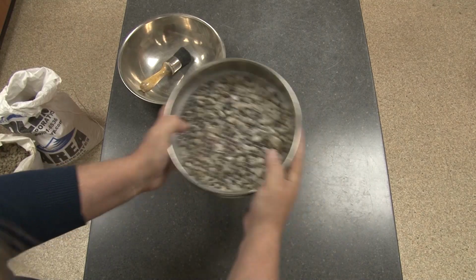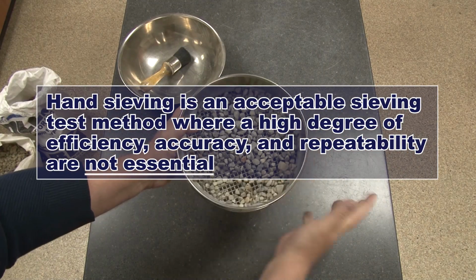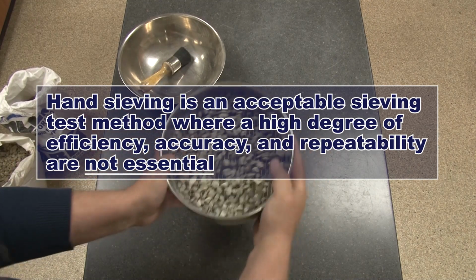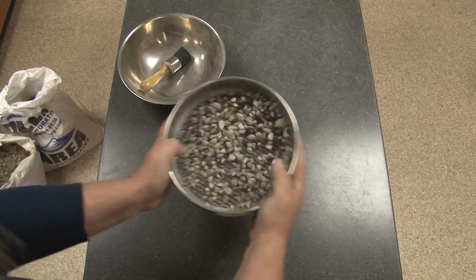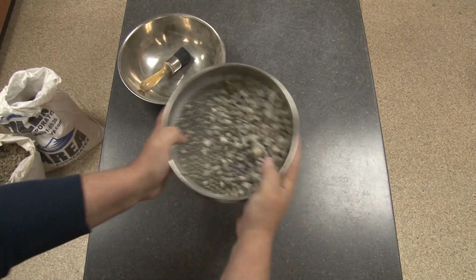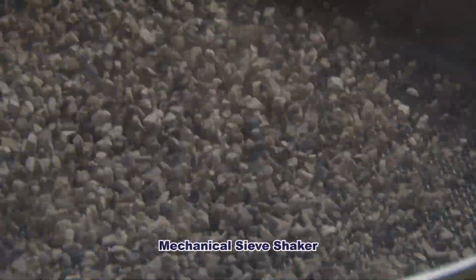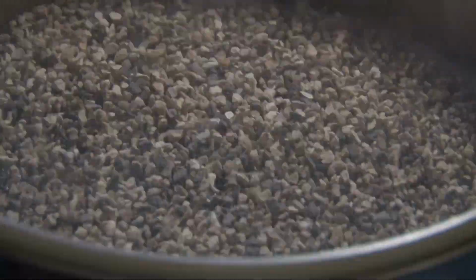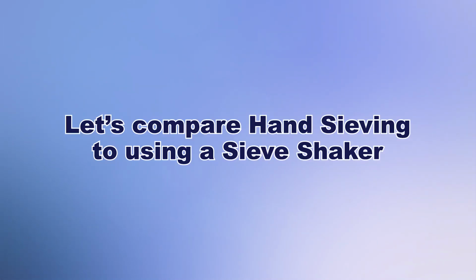Hand sieving is the most basic way to perform sieve analysis and is acceptable for applications where a high degree of efficiency, accuracy, and repeatability are not essential. Results are highly operator dependent and can vary significantly. Using a sieve shaker automates the agitation process for particle separation and size determinations. Let's compare hand sieving versus using a sieving device.